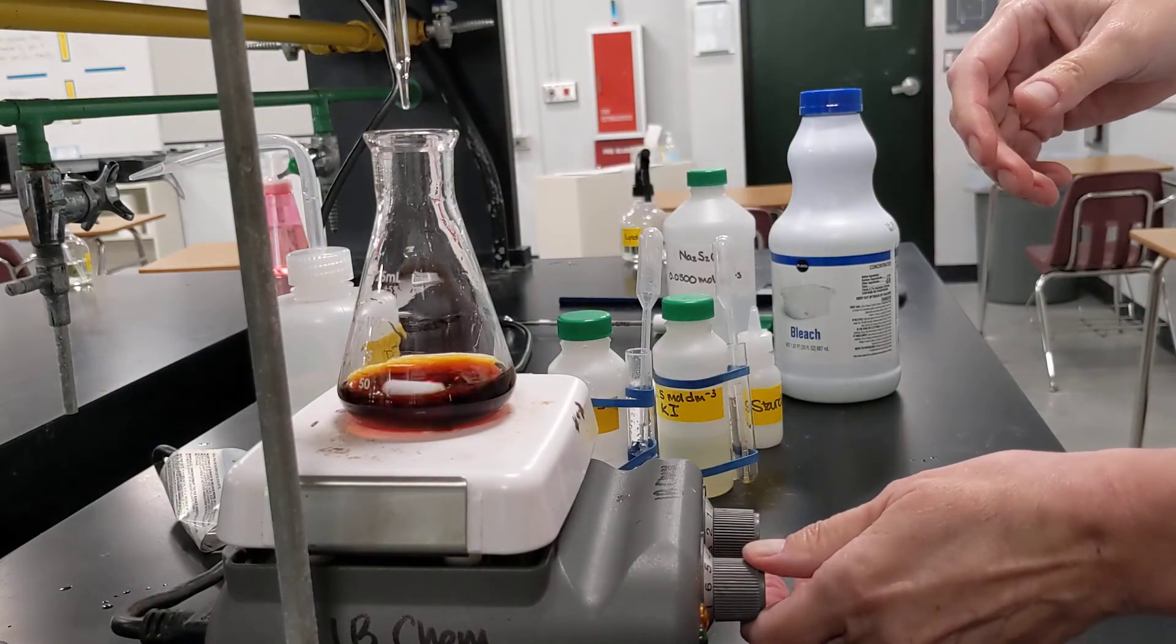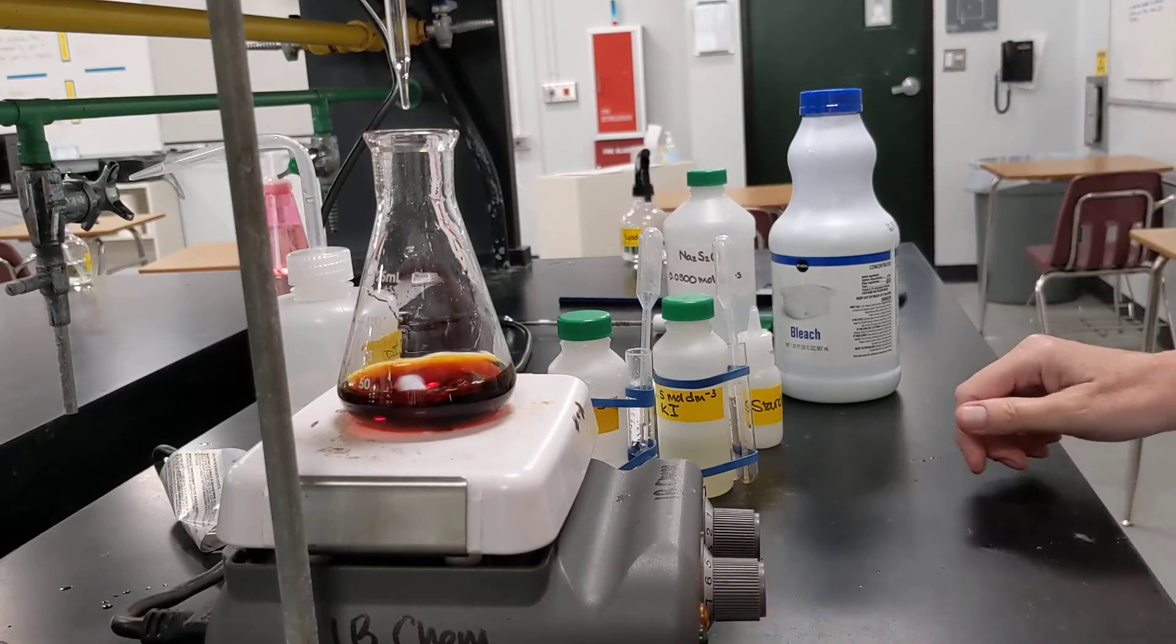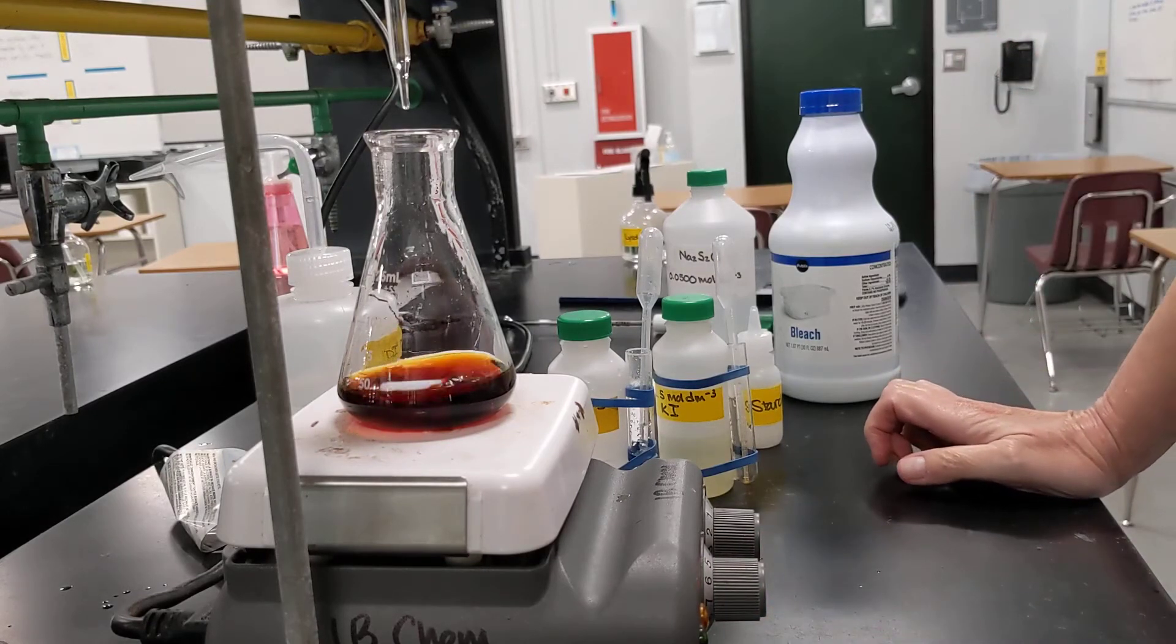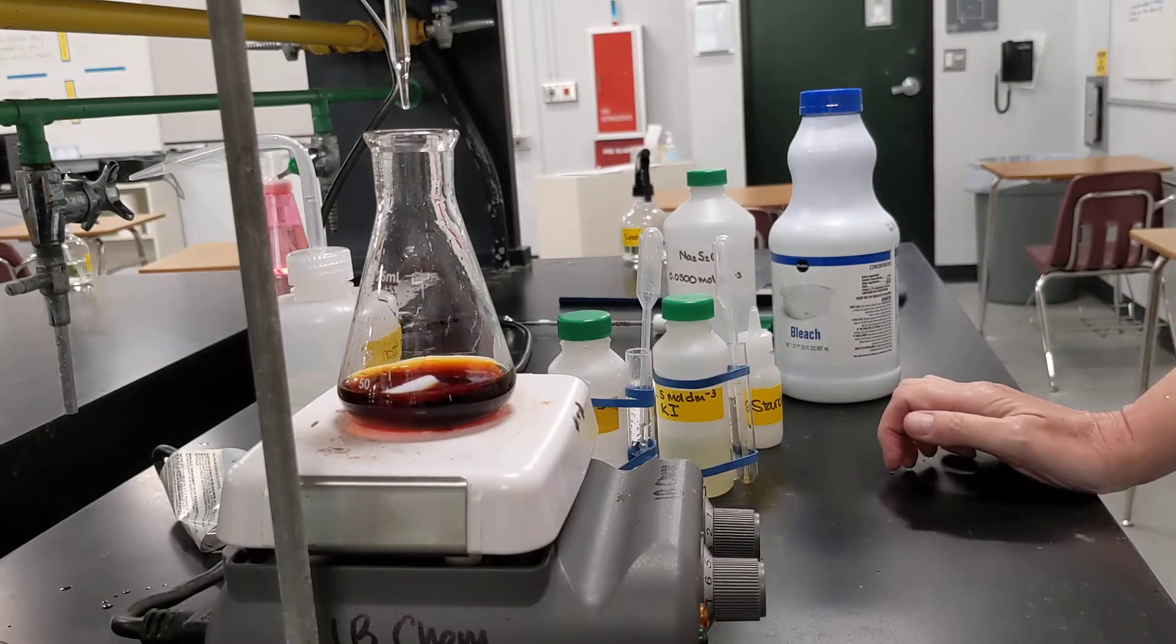All right. So I gave that a rinse. I'm going to turn on my stirrer. All right. And let's get an initial volume here. Initial volume is 11.91 cubic centimeters.